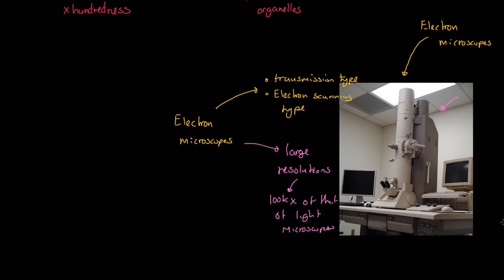But nevertheless, we see the real distinction of why this is such a powerful and important structure for us, particularly when we're looking at things like molecular biology. And actually, one of the things I should add before we go any further, depending on where you read this, it's going to get us down to something like 0.1 nanometers. Now, it's hard to even comprehend how small that is. Just bear in mind that some textbooks might say 0.2 nanometers. We're talking about very, very small, tiny structures when we get to that level.